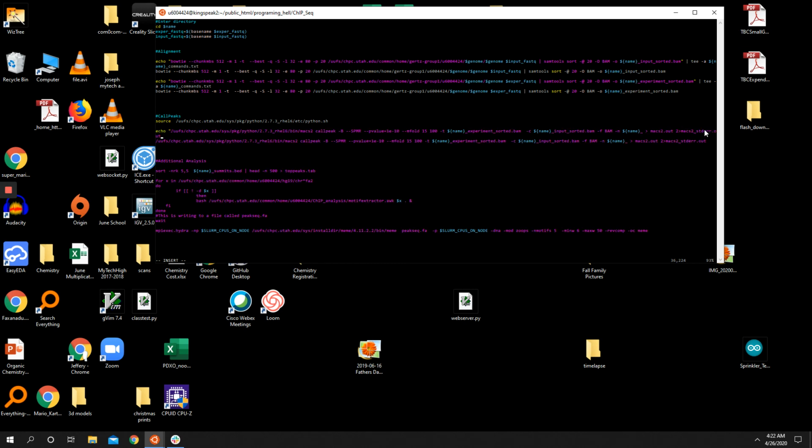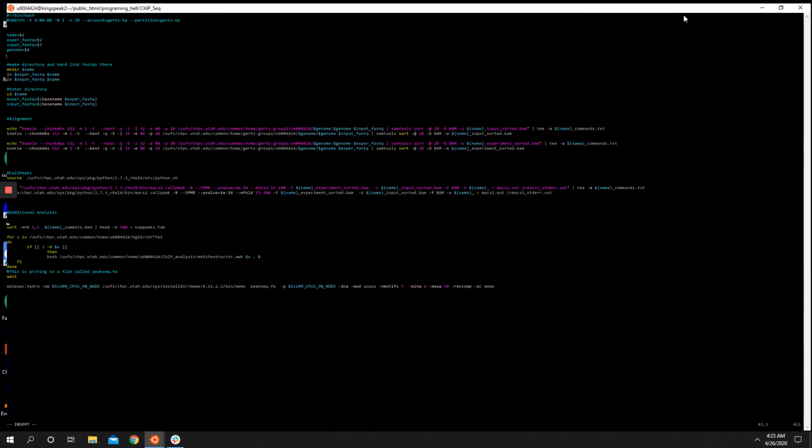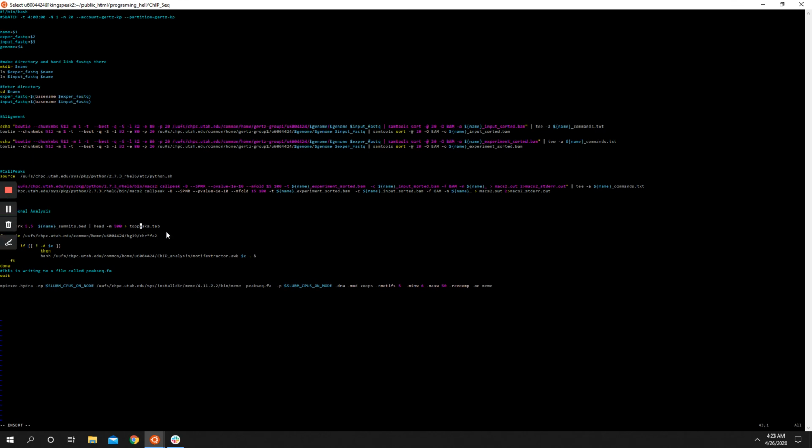Echo that line, pipe to T, output to --append, $name, and some text. Yeah, so you get the idea. I'm basically just running this whole thing over and over again.